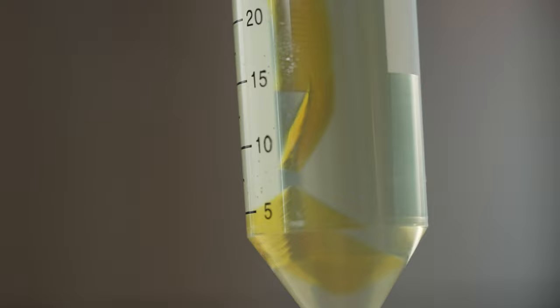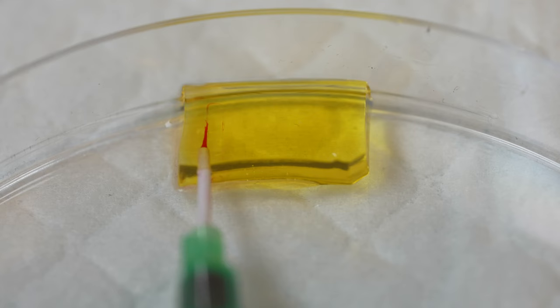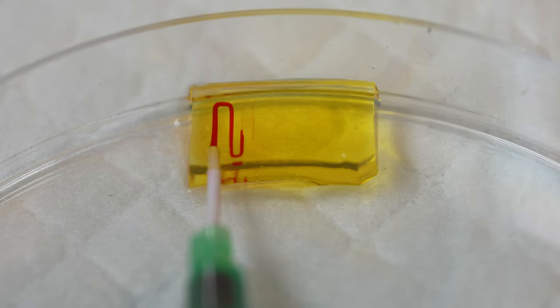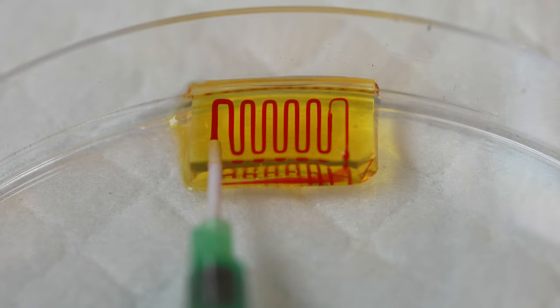When you 3D print them, they have the consistency somewhere between jello and a gummy bear. They're soft and squishy, but they also hold their shape. So we can print them with different channels inside, for example.